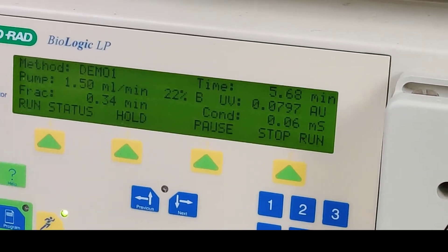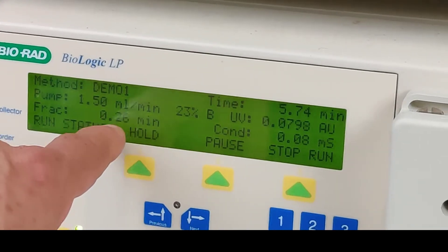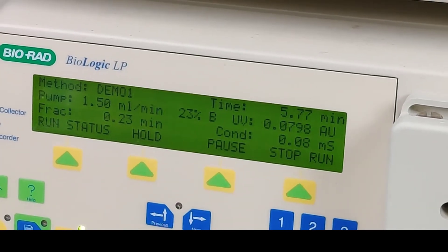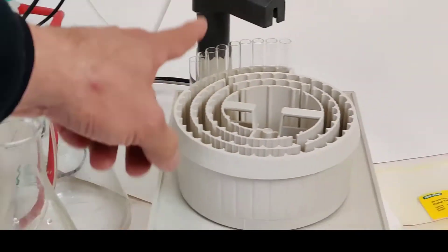At this point in the test, in 0.3 minutes, it will be delivering through the fraction collector into the sample tube.